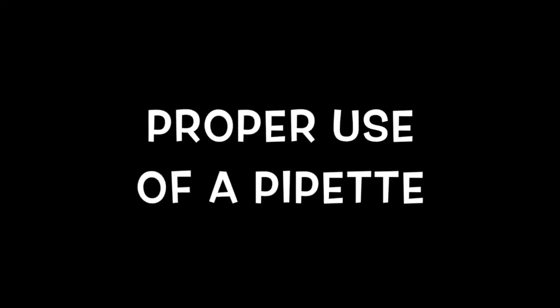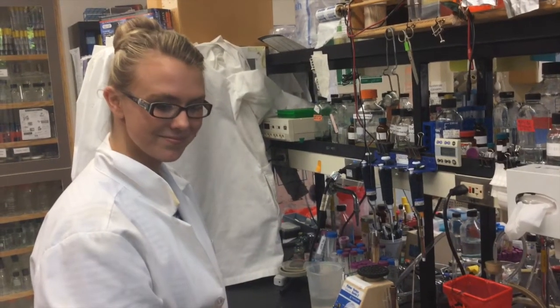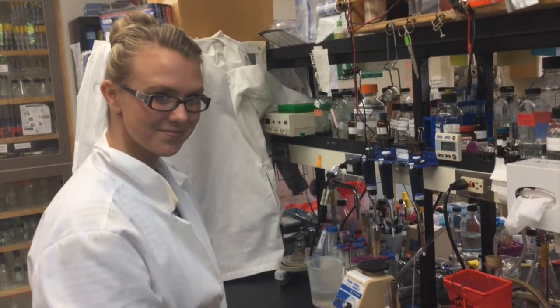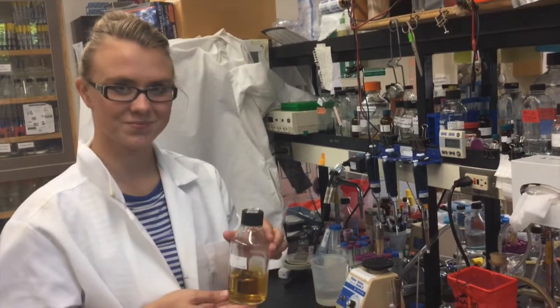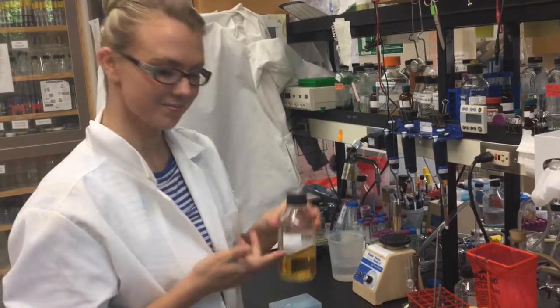Next, we will learn how to properly transfer fluids using a pipette. Let's look at how to grow bacterial cells in a broth. To prepare, we will transfer some sterile broth, our liquid growth medium, into some sterile tubes.